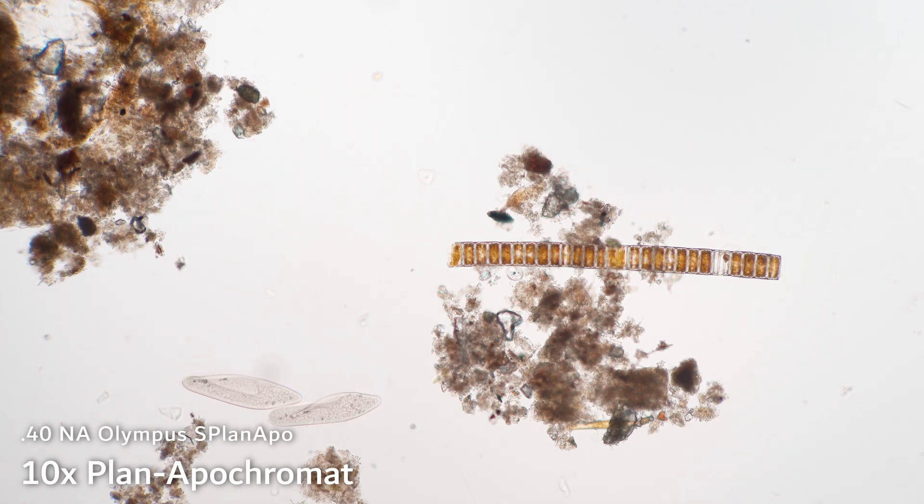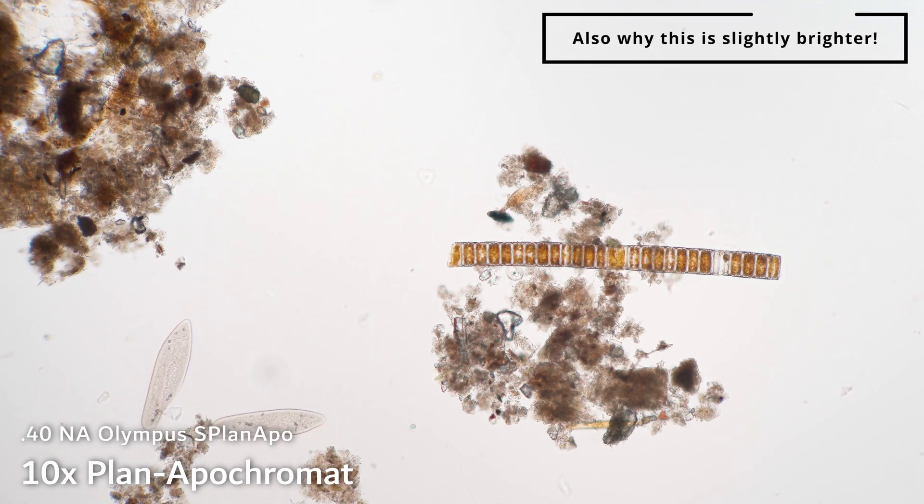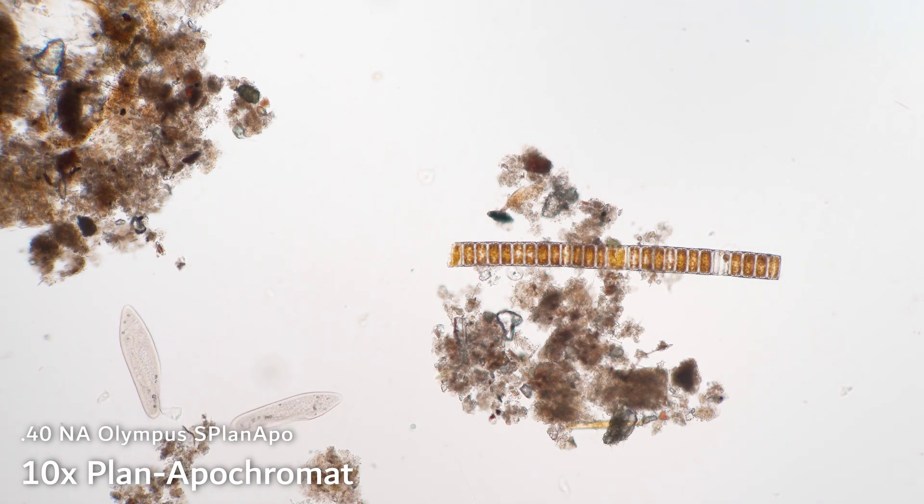Check out these paramecium getting very cuddly with each other. This objective also has a higher numerical aperture than the other two. That means it can resolve smaller details more accurately. That's generally something you're going to find on higher-end objectives, and it is a very good reason to buy these objectives as well, besides the improved chromatic performance. But you will expect to pay at least $100, probably at least $200 for these plan apochromatic lenses.